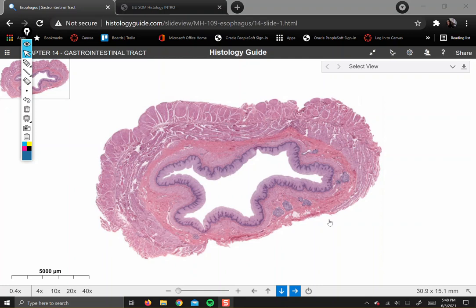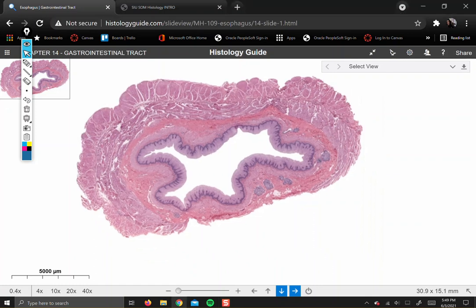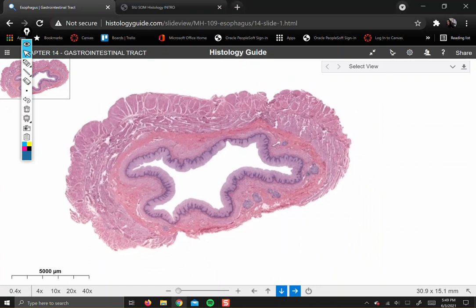So as I always recommend, we want to start zoomed out. I know that there's temptation to immediately zoom as far in as you possibly can because students kind of associate zoomedness with detail. But you have to learn the lay of the land first and make general observations so that what you see when you zoom in has meaning or context. If you zoom in too soon, you'll get lost in the weeds, and that's not what we want here. So let's have a look at what we see here.